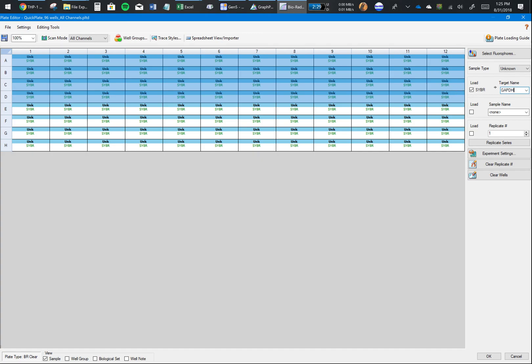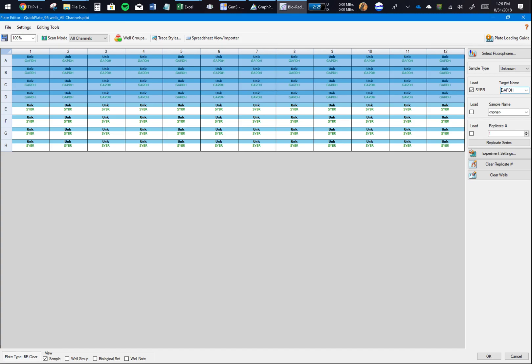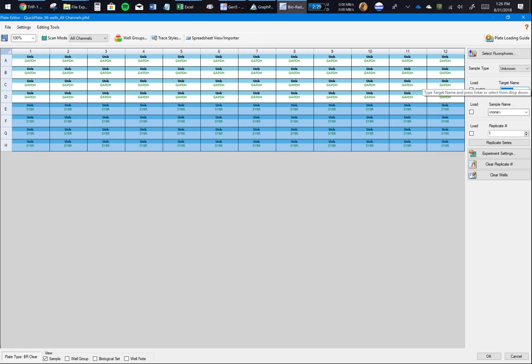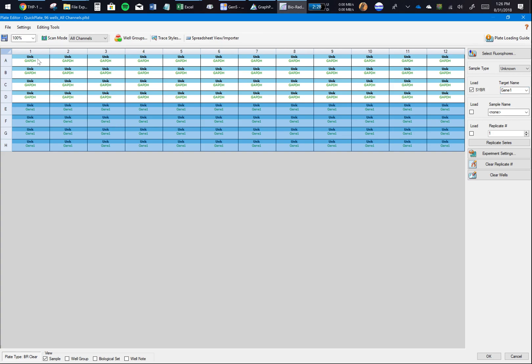Now you want to tell the software what primers you loaded. Your Target is the same as the primer or the gene you're looking for. Let's say I loaded all GAPDH in all of these wells I've selected, so I'll select all these and write GAPDH.